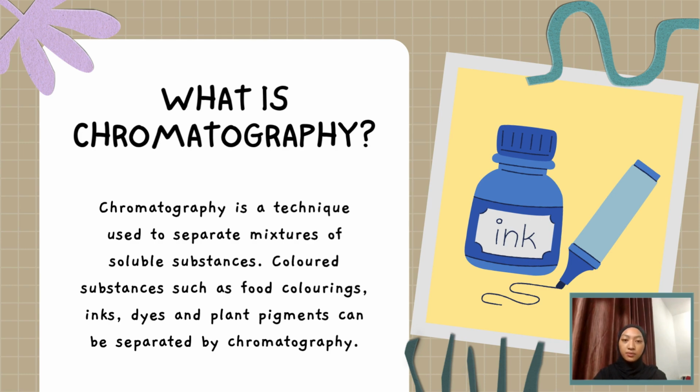What is chromatography? Basically, chromatography is a technique used to separate a mixture of soluble, colored substances such as food colorings, inks, dyes, and plant pigments.